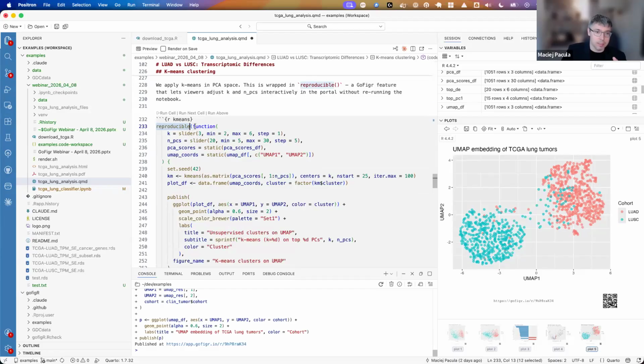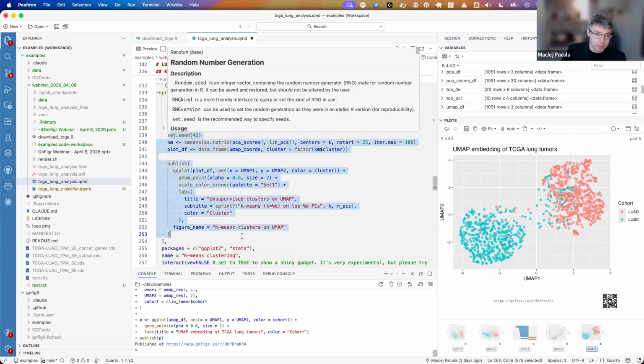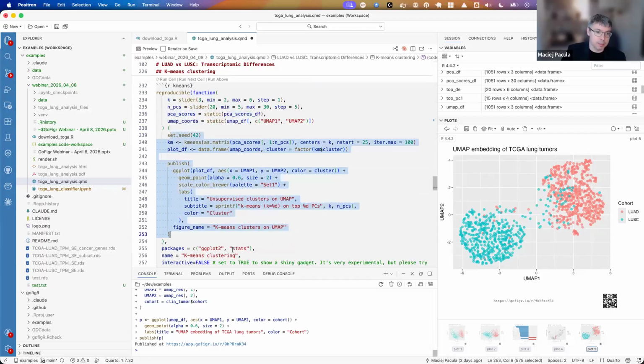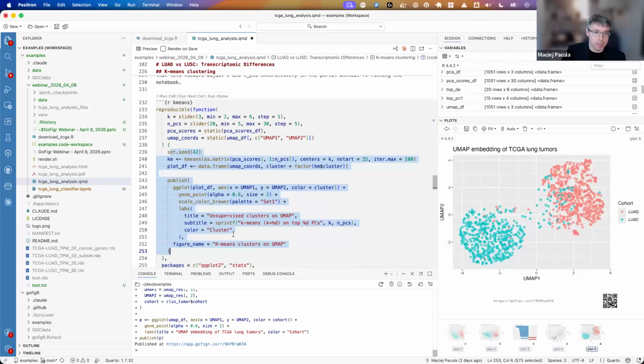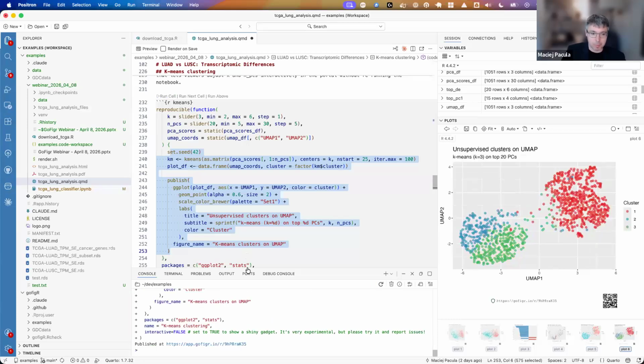And what this does is it captures the exact inputs that your analysis needs. That includes data as well as other parameters. And then it executes that function in that clean room. So because the inputs and the packages are fully defined here, you ensure that whatever code runs here is reproducible down the road. So let's run this and I'll show you what it looks like.